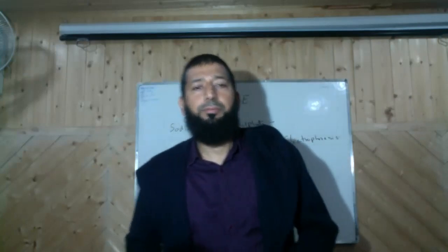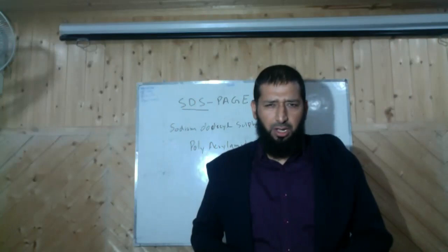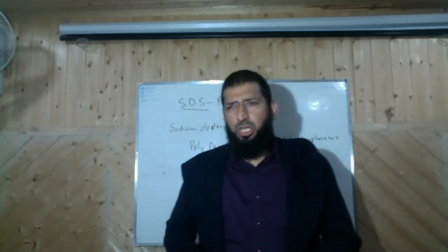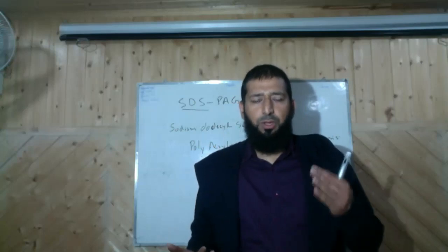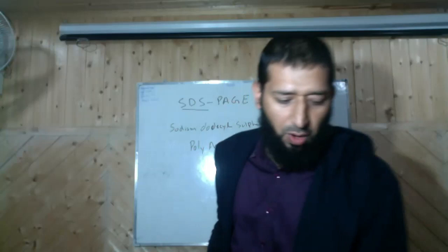Okay, so we usually in our lab run proteins in this SDS-PAGE. While running an agarose gel, it's very easy to prepare the gel and to prepare the DNA. However, in this case, it's a little bit tedious because there are various constituents. And in this SDS-PAGE, we usually run two gels, one we call the stacking gel and another we call the resolving gel.